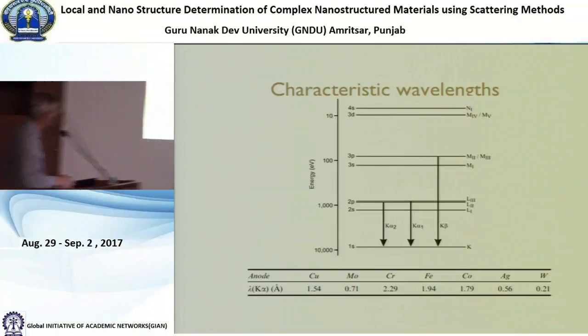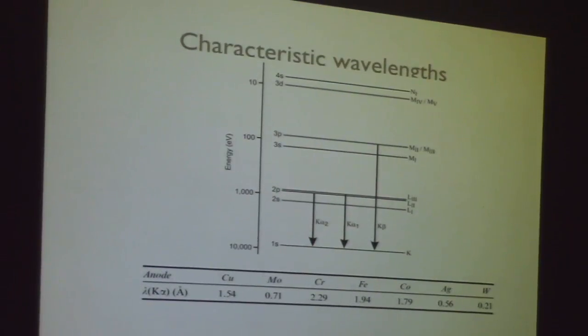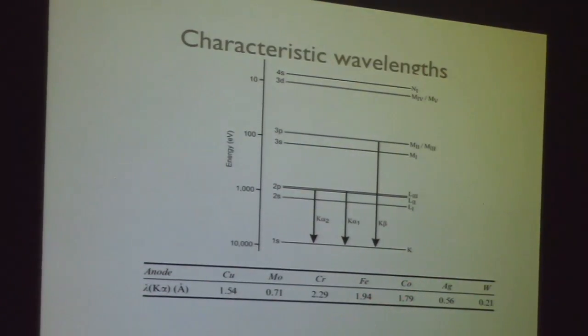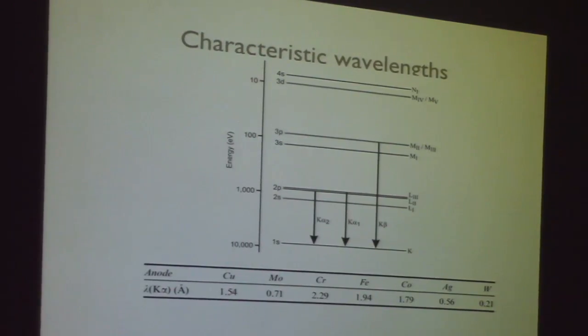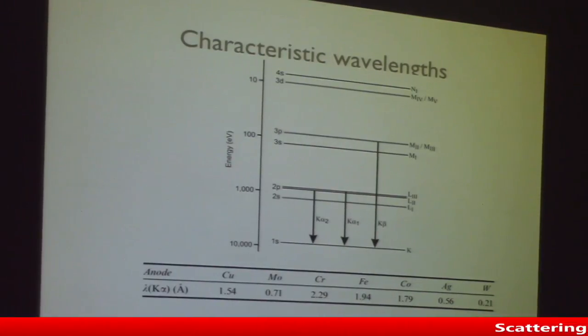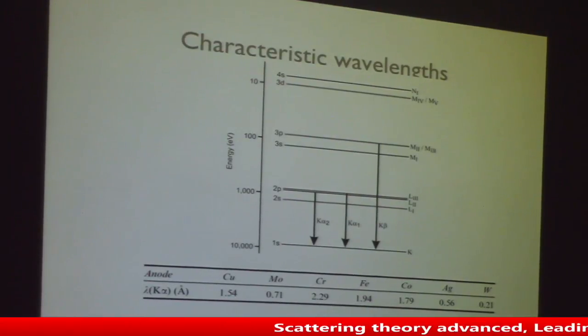So what happens is that although silver seems like a really good option, there are certain trade-offs with silver, and so I generally recommend that if you're going to make a setup that will be robust and will last a long time and will give you good intensity, you should go with moly. And then the trade-off, of course, is that it limits your Qmax.